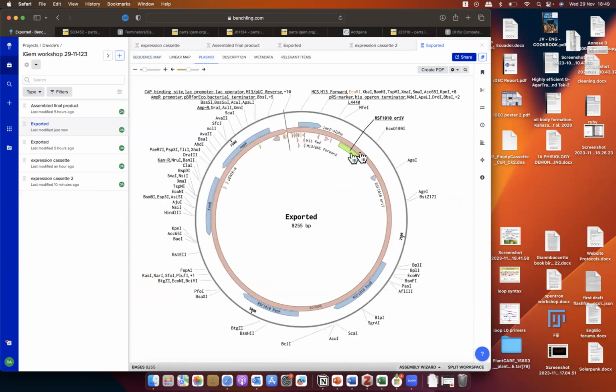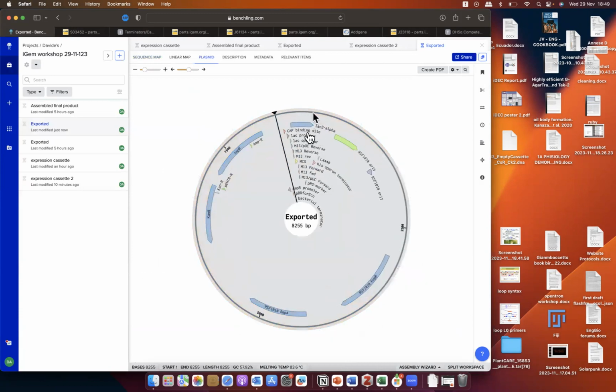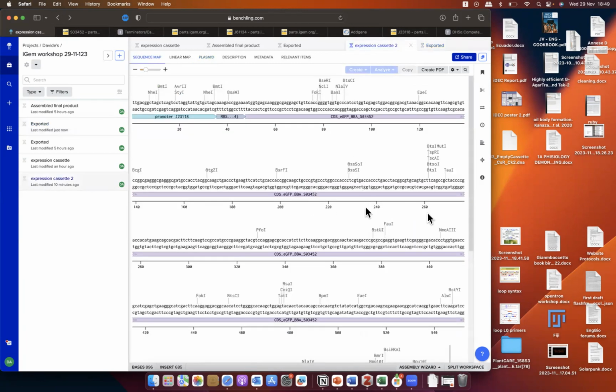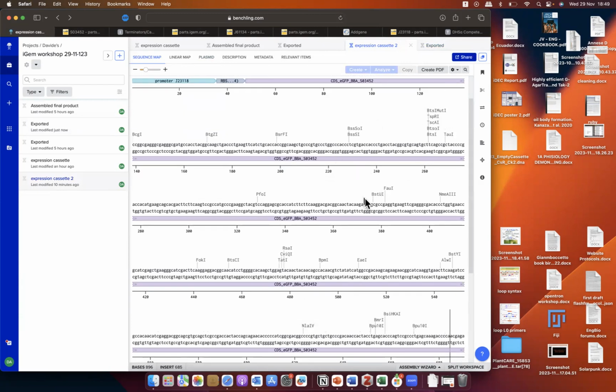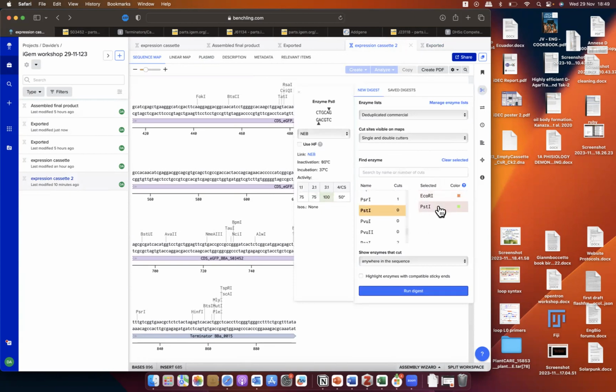We don't really need this one. Okay, it has a lacZ and it has ampicillin and kanamycin resistance. We're most interested in kanamycin. Ampicillin is just a secondary effect; we don't really care too much. It's a high copy number. I know because I remember when I looked for it on the website. But anyway, what we do now is look for EcoRI and PstI.